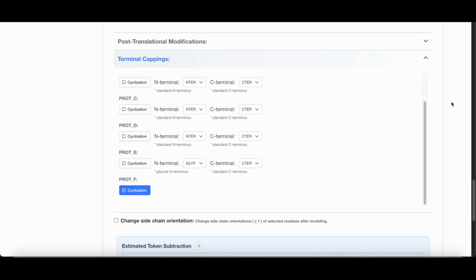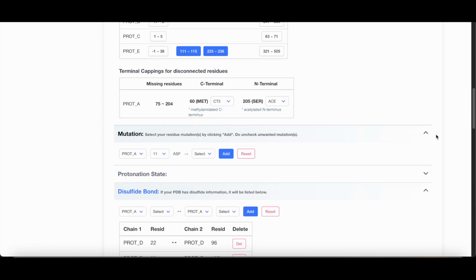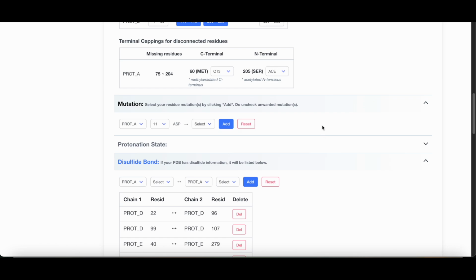6. Mutation. The MC4R protein has several mutation types. Within the PDB Reader, you can modify residues to introduce specific mutations. In this example, we will generate the S188Y and Y268I mutations. The MC4R protein is assigned to Prot-E.